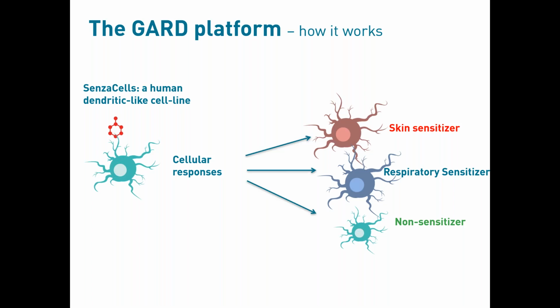Of course, once you have defined your biological system, you also need to find a way to see how these cells actually react to external stimuli, such as, for example, when exposed to a sensitizer. The conventional way that many in vitro models monitor the cellular response is to look at only one or two biomarkers, such as, for example, the upregulation of different types of phenotypic markers.